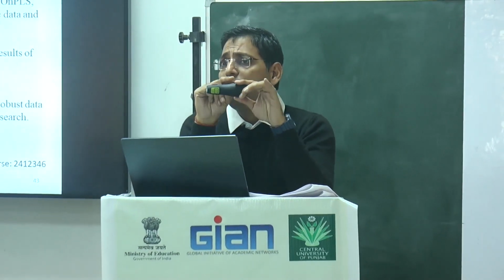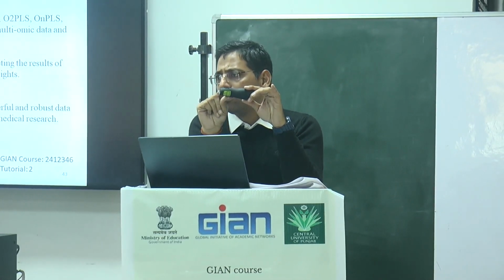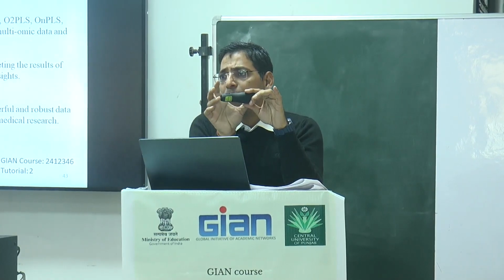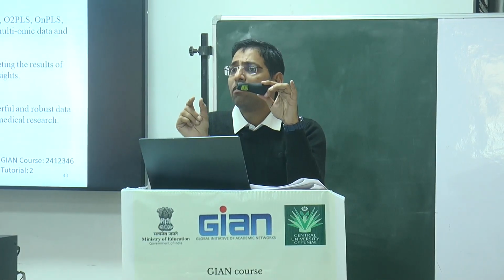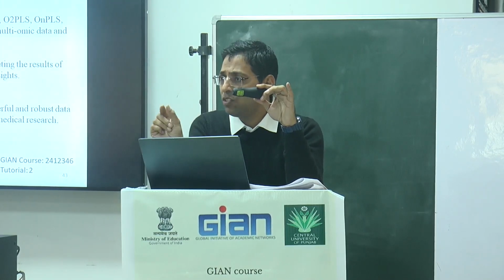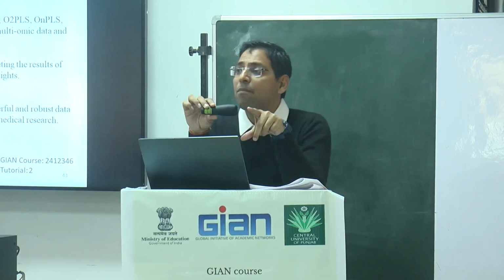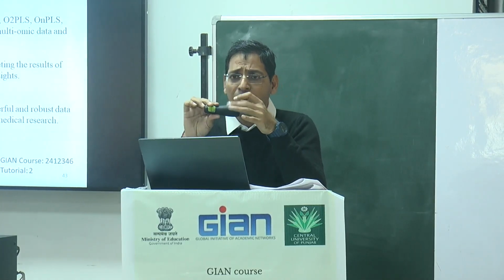So now, if you manipulate the interactions between the analytes and your column that has some specific particle, you can manipulate the retention time by which that compound is coming from the column. This retention time varies from one set of experiments to another, depends on the methodology, depends on the conditions, depends on the type of column you are using, and even depends on what type of metabolites you want to identify. So there are so many parameters. It has a mathematical equation also.